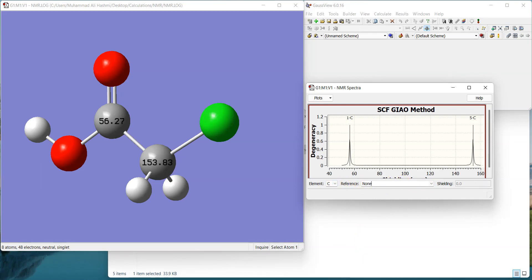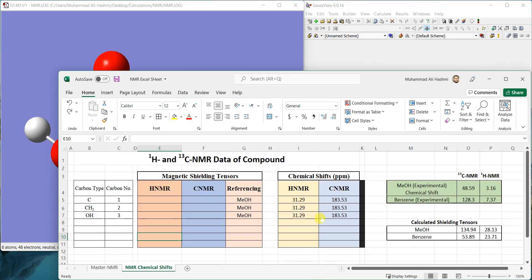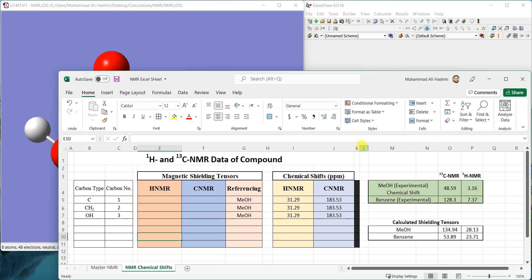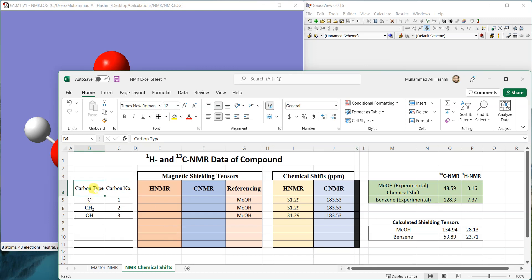For that purpose I have made an Excel sheet. You can make your own and I'll probably add this sheet to GitHub and add a link in the video so that you can access this sheet. If you want you can make your own or you can extend it. Here I have basically added a different - it should be atom type instead of carbon type. Mostly there are carbons that's why we just write down the carbon type.